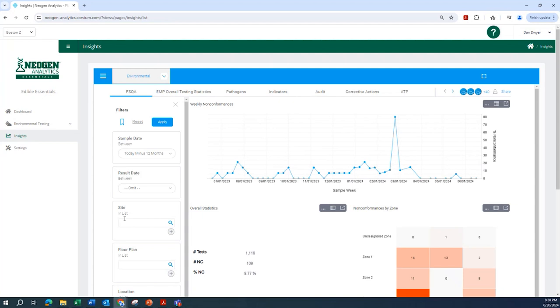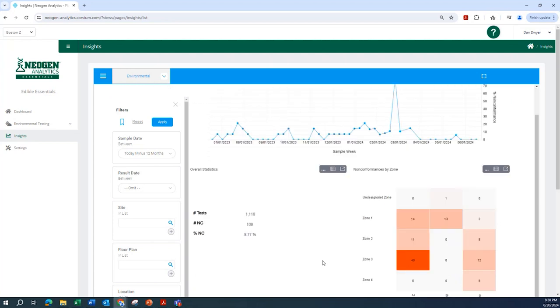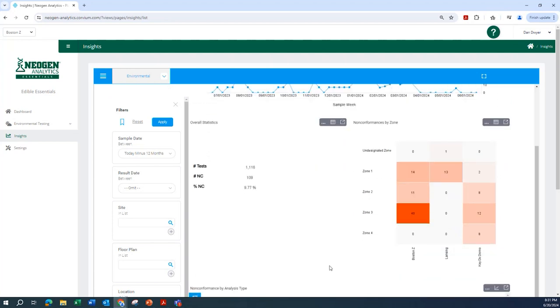Insights is Neogen Analytics reporting engine, providing detailed reporting by test type, zone, and dozens of other parameters that allow you to recall and communicate information quickly and accurately.